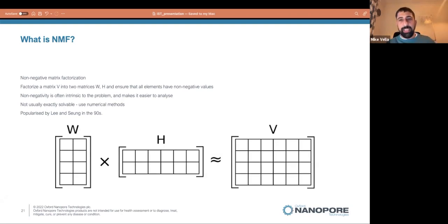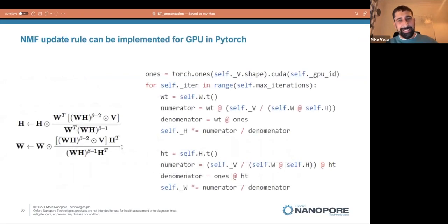And by doing this technique, you can split this down into different mutational processes, and thus begin to understand how exposure to one mutagen, or how one lifestyle choice, affects different mutation types, and how that relates to often cancer. So this is a nice technique because it's not really deep learning. It's a more classic machine learning technique. And my role in working on this technique was making it really fast.